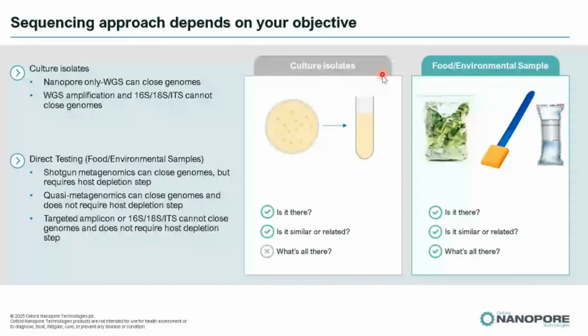Okay. So after looking through some of the companies and research groups, and even the research community, using nanopore technology on food, as well as foodborne pathogen detection and food authenticity, here I would like to look at a more in-depth workflow on using nanopore for those purposes.